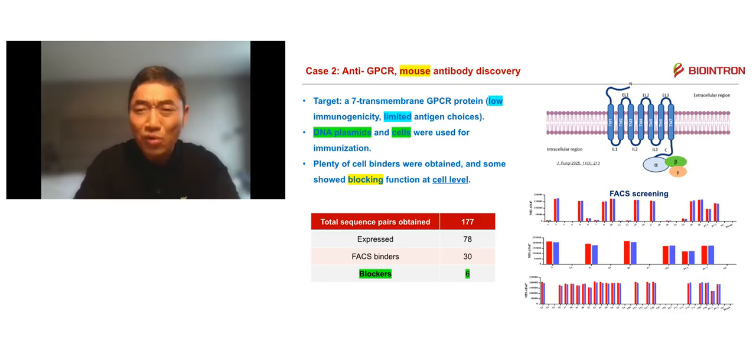Even if you keep all of those B cell clones, you have little chance to get your dream hits.